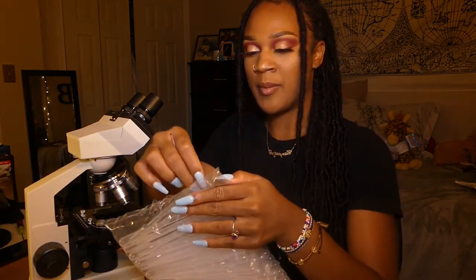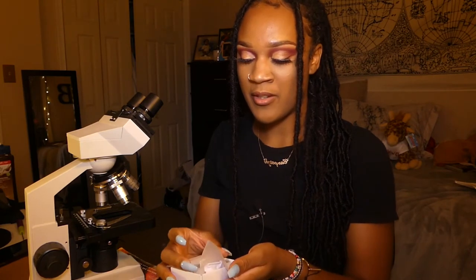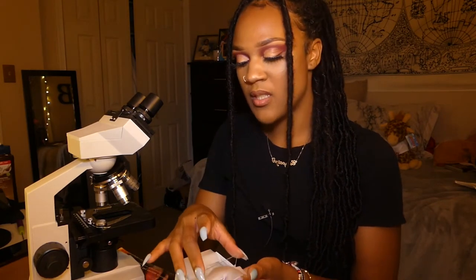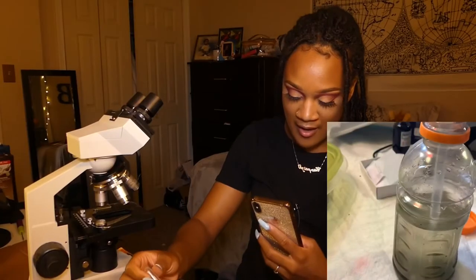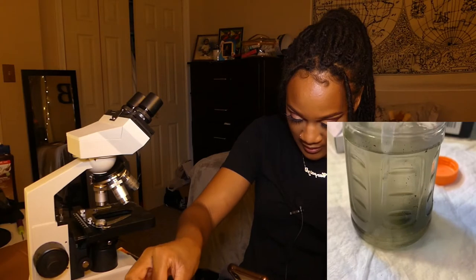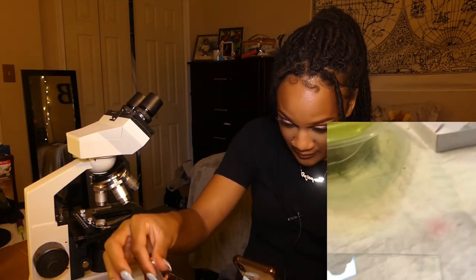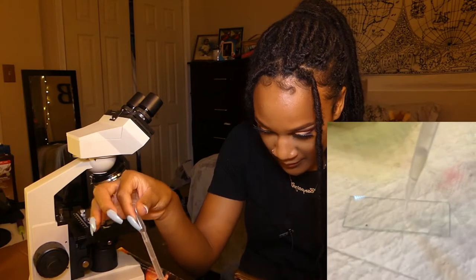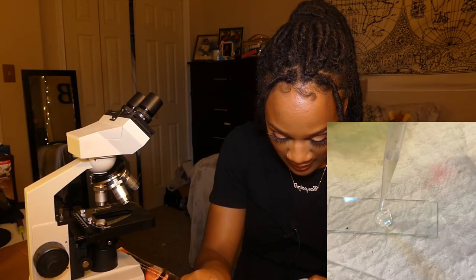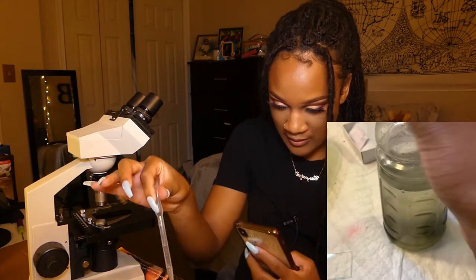So I'm going to take my transfer pipettes, and then with my slide. I'm not going to use gloves because it's pond water, so we should be fine. I have my plastic pipette tip, and I'm going to squeeze and kind of disturb the sediment that's at the bottom. And then I'm going to take a sample from the bottom, make sure I have something in there, something floating. Then I'm going to squeeze onto the slide and do like 3 drops, that should be fine. Squeeze the rest in there.